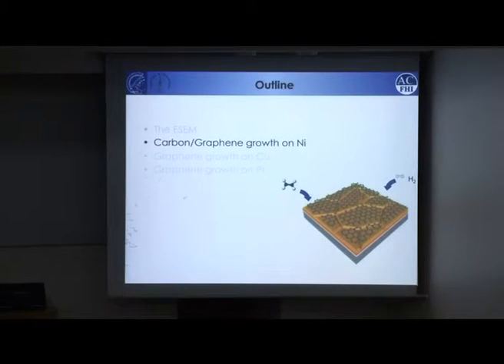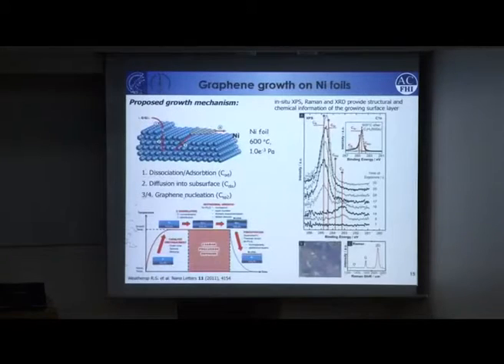First I will show a bit about how graphene grows on nickel and copper, then platinum. The whole story started with a group from Cambridge. They came to Berlin. There's a synchrotron, and we have some high-pressure XPS machine there. This group was studying nickel catalysts, and they did chemical vapor deposition growth of graphene. While doing that, they were looking at the carbon 1s edge with a synchrotron, this XPS machine.